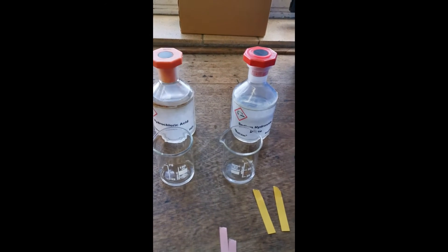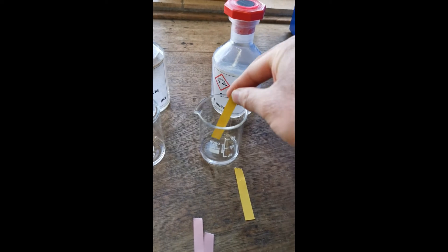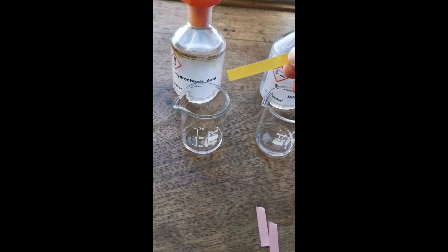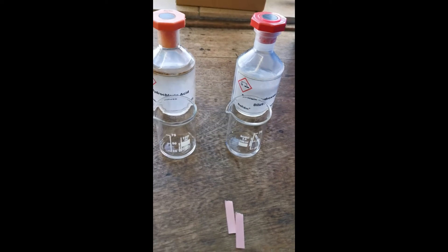First of all I'm going to use the universal indicator paper to dip into the sodium hydroxide solution, and you can see it turns blue. I'm then going to add the next bit of universal indicator paper to the hydrochloric acid, and you see it goes red. So this is how we can confirm the presence of an acid and an alkali.